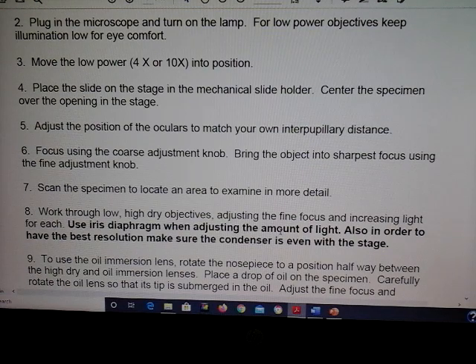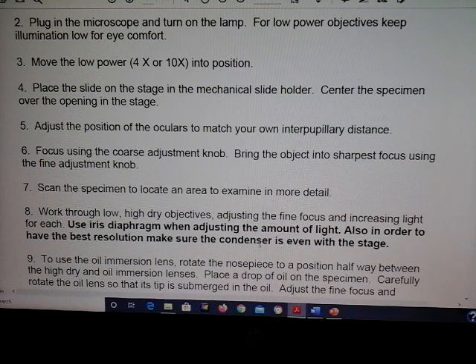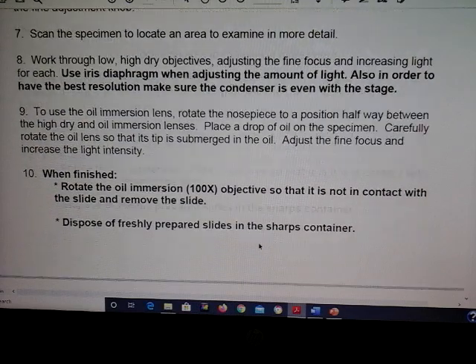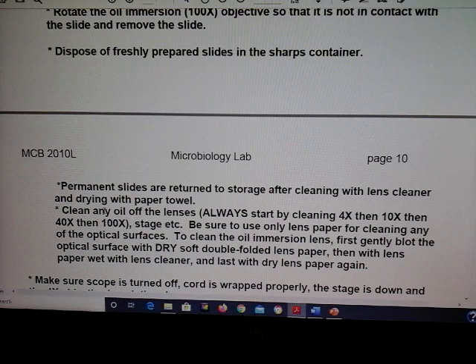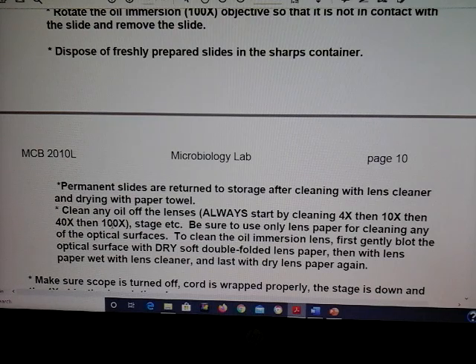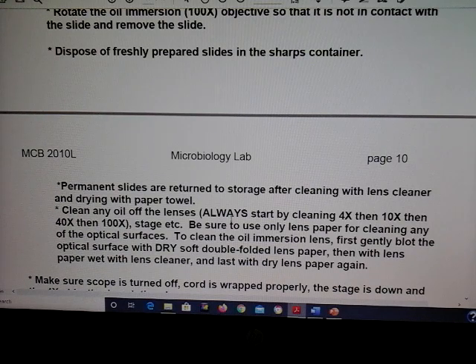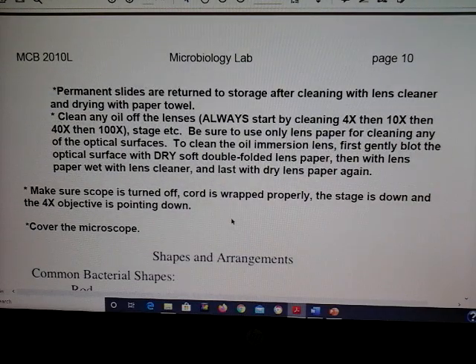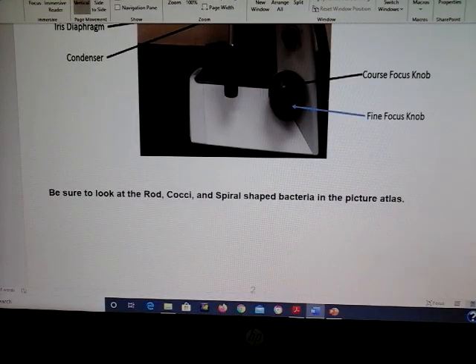You don't want to keep turning up the intensity — use the iris diaphragm to get more light into your specimen. For best resolution, make sure the condenser is even with the stage. When finished, clean your lenses — always start by cleaning the 4x first, then 10x, then 40x, then 100x. This will be on your test. Also, anything in bold in the lab manual or handouts will be on your exam.